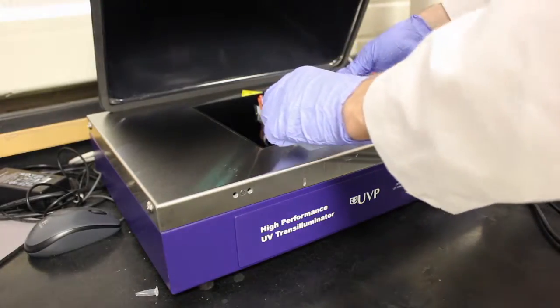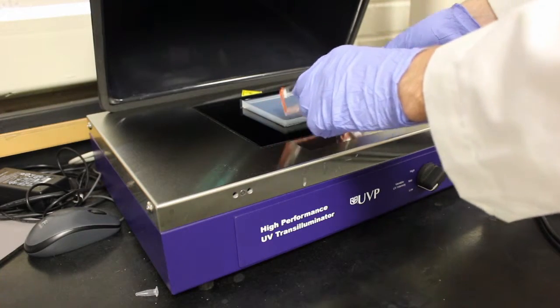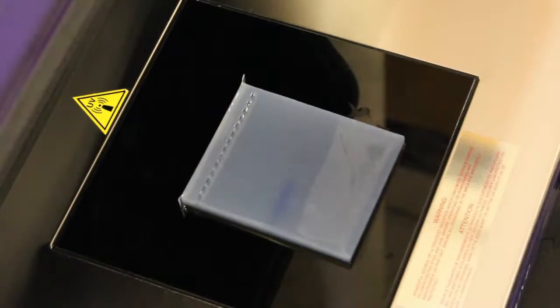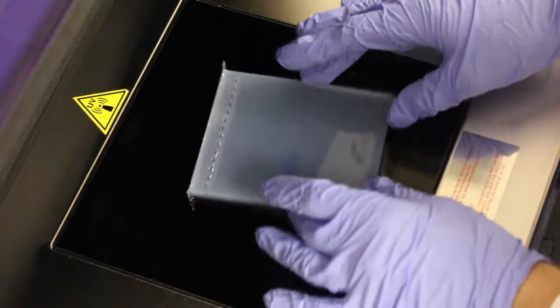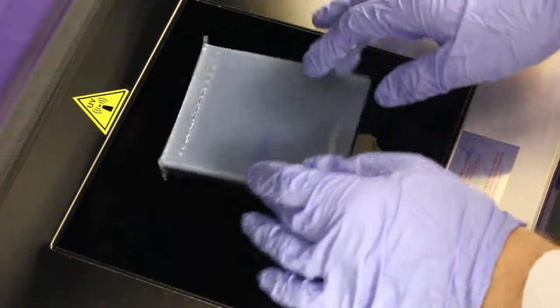Slide the gel onto the ultraviolet emitter. The gel can be moved around on the emitter to eliminate bubbles formed between the gel and the emitter surface.